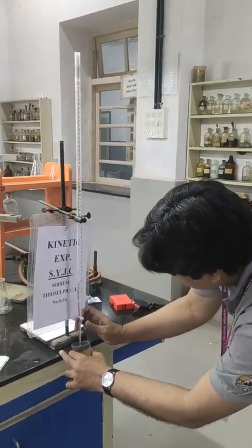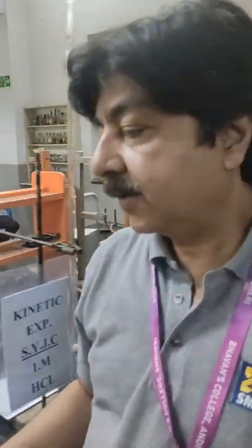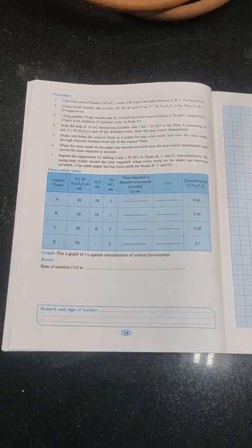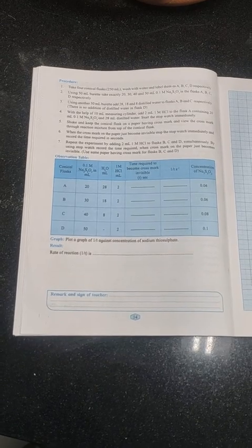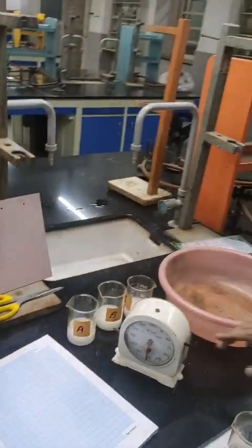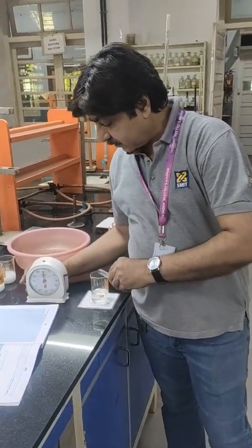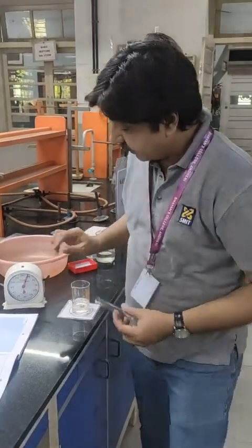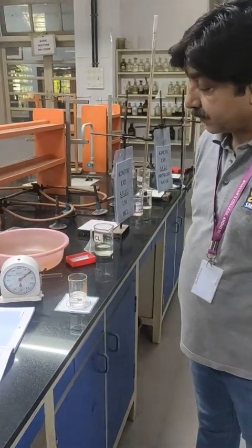So here we have taken the specified quantity of sodium thiosulfate as per the handbook, and to that I will be adding 2 ml of HCl. Once again I am resetting the clock and I am starting the stopwatch by adding 2 ml of HCl to sodium thiosulfate solution.